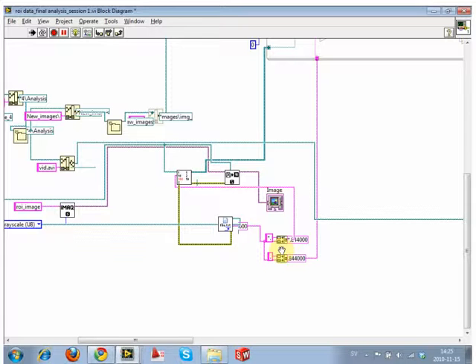Now it's like this star and dot or dot. Right, it's 814.000, which is wrong. That's not a file extension, right? So we're looking at it and it's like, why is there a number when I would expect .jpeg or .whatever? Means we wired it wrong.